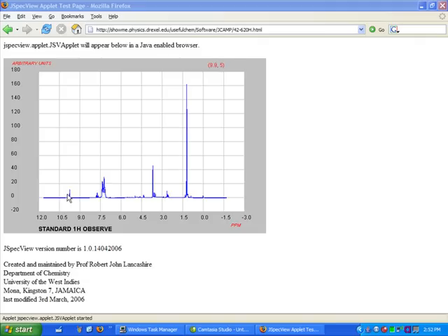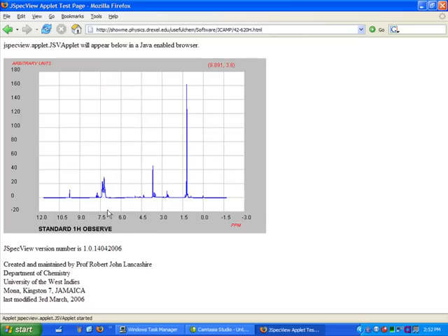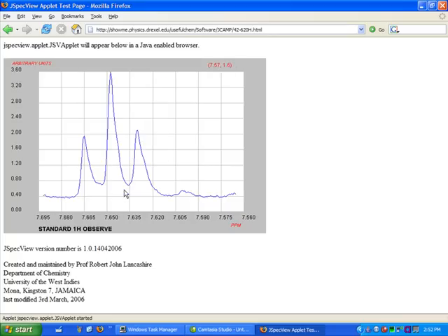Well, we still have our original aldehyde triplet. We'll zoom back out. And we can see in this aromatic region, a little bit downfield from there, we have a few more peaks that are popping up. And I want to focus specifically on this little triplet here that's coming up. So if I magnify this, I can see that it's coming in at about 7.65, and I can measure the coupling constant, which is 5.3 hertz in this case.